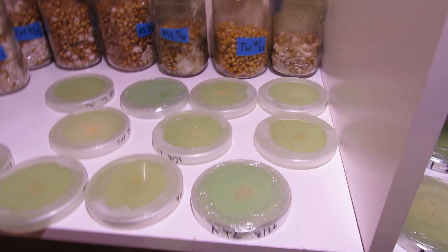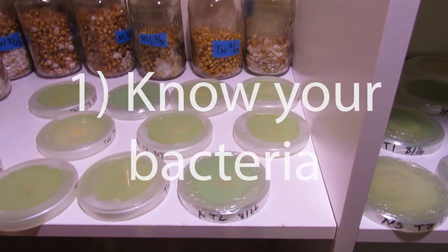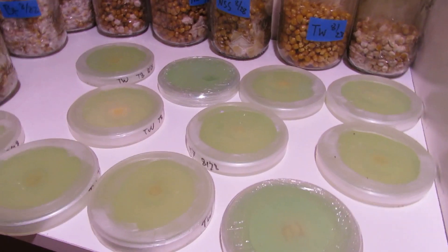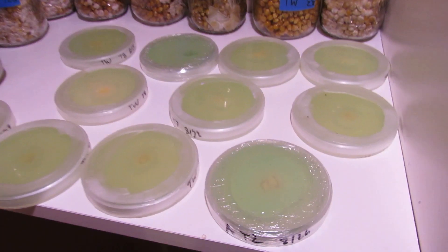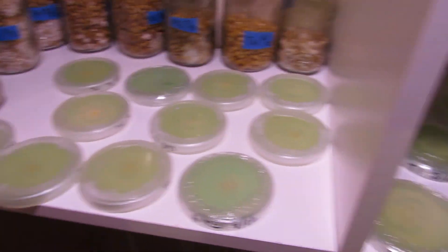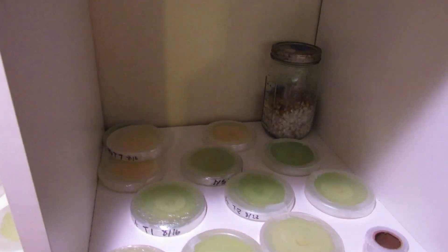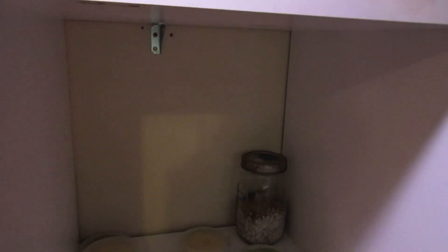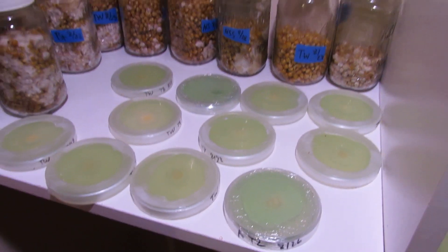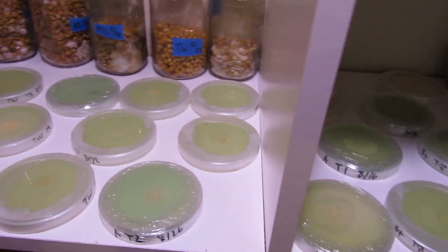Number one is to know your bacteria. Is it coming from the tissue sample? Is it coming from the side where it didn't seal properly? Does it look milky? Does it look watery? Is it coming in little spots? You really want to know bacteria. Occasionally you'll run into mold-type contaminations — black, green, blue, funky looking molds — but the main problem is definitely going to be bacteria.